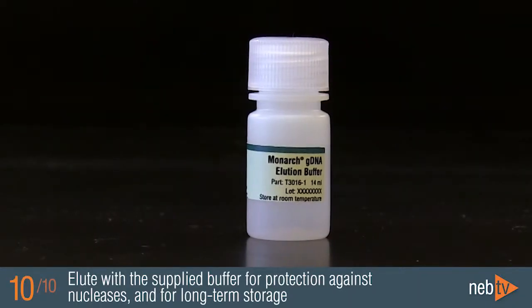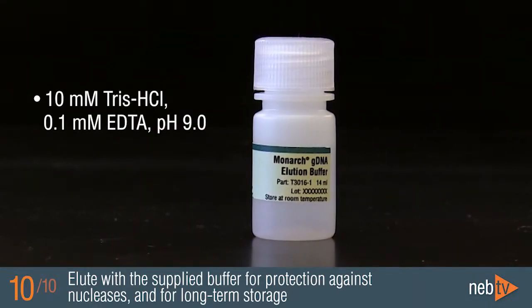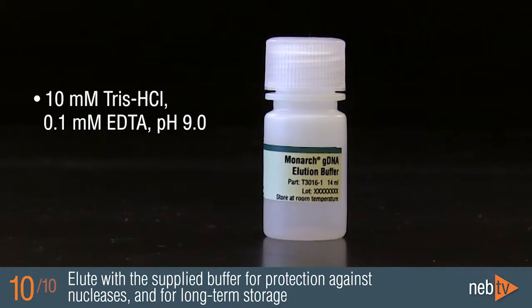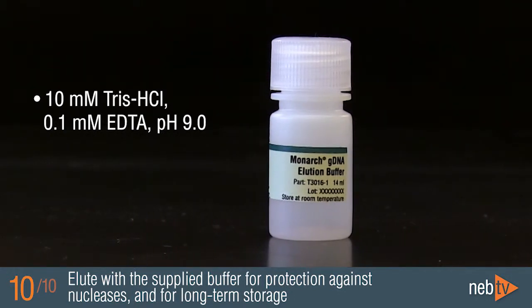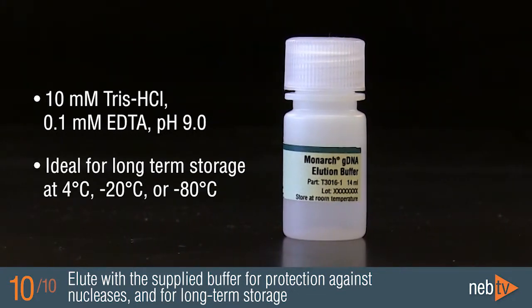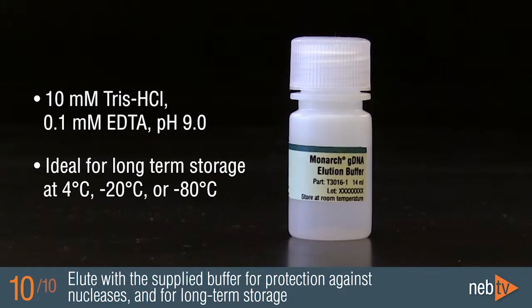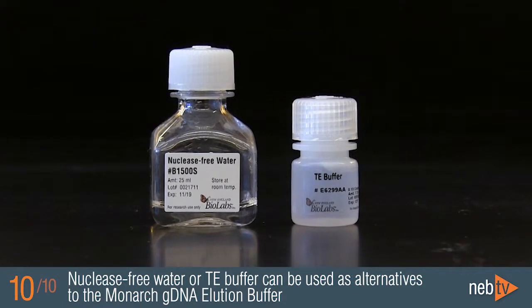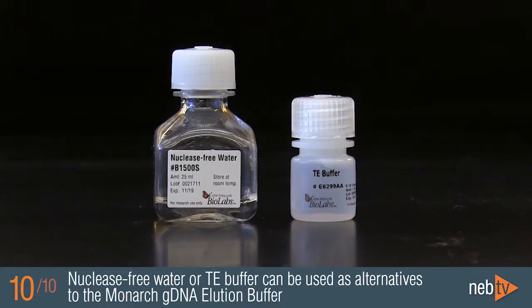The supplied elution buffer contains 10 millimolar TRIS and 0.1 millimolar EDTA at a pH of 9. The high pH and the EDTA give excellent protection against nucleases, which makes it highly suitable for long-term storage at 4, minus 20, or minus 80 degrees Celsius. Alternatively, nuclease-free water or TE buffer can be used for elution.